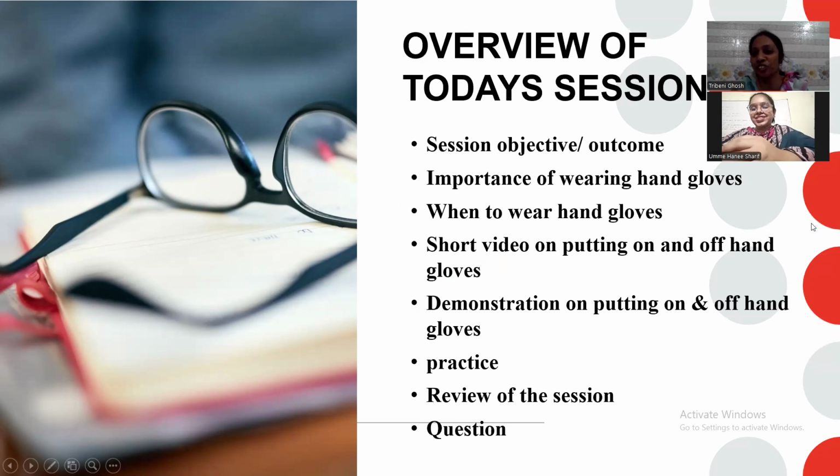Anyways, overview of today's session. First we will learn what will be our outcome of today's session. Then we'll learn why wearing hand gloves is important. Then we learn when to wear hand gloves, and we then see some short videos on putting on and putting off hand gloves.